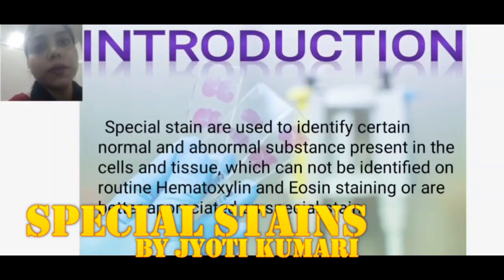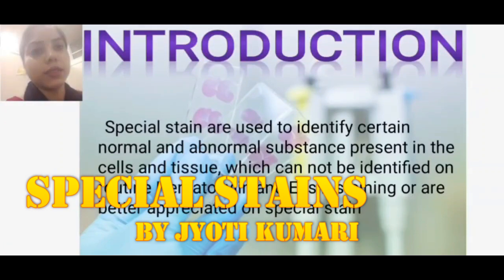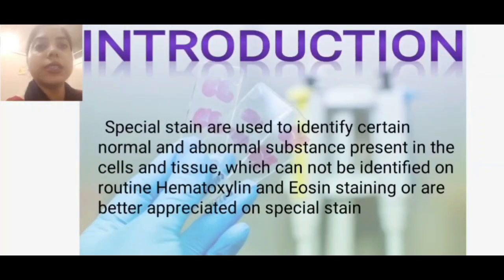In this video, we are going to learn about special stains. Basically, special stains are used to identify certain normal and abnormal substances present in the cells and tissues, which cannot be identified on routine hematoxylin and eosin stain, or are better appreciated on special stains.